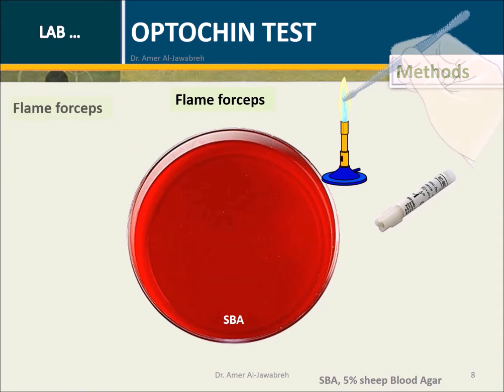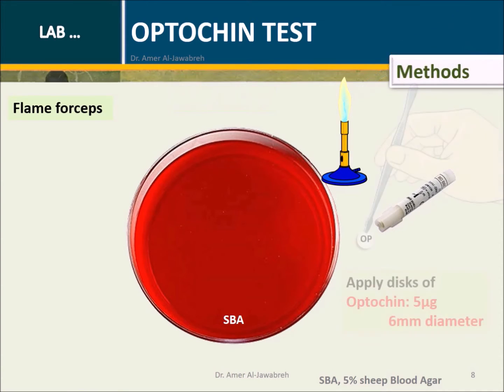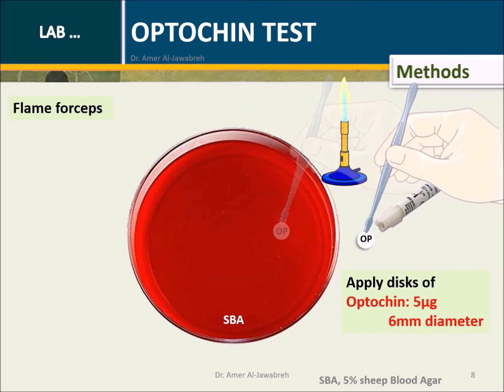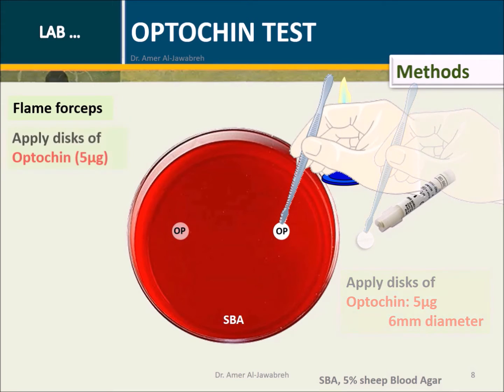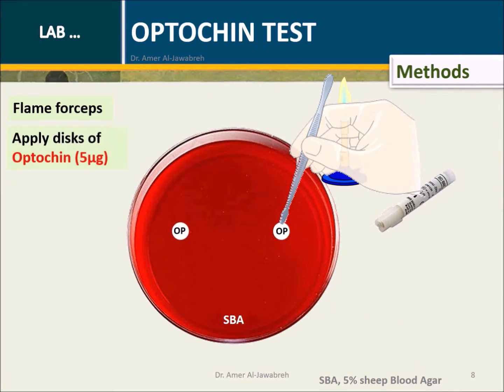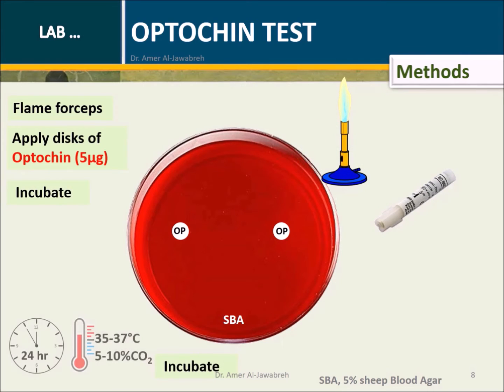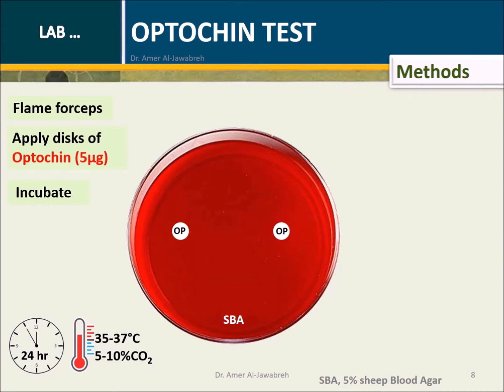Flame forceps. Apply discs of optochin to the streaked plates. Incubate for 24 hours at 35–37 degrees centigrade in 5–10% CO2.